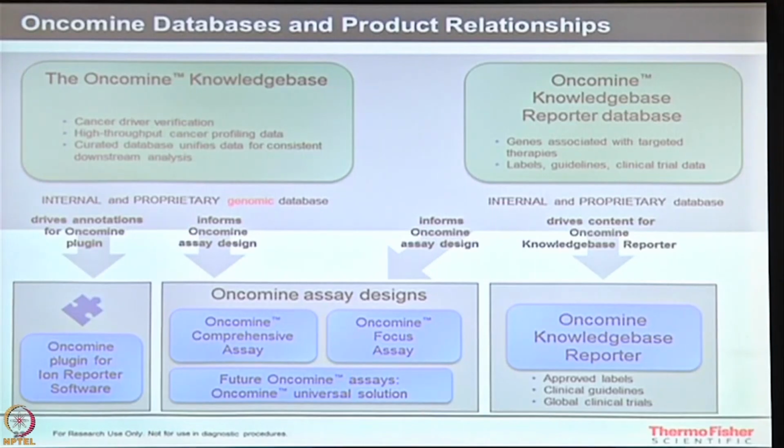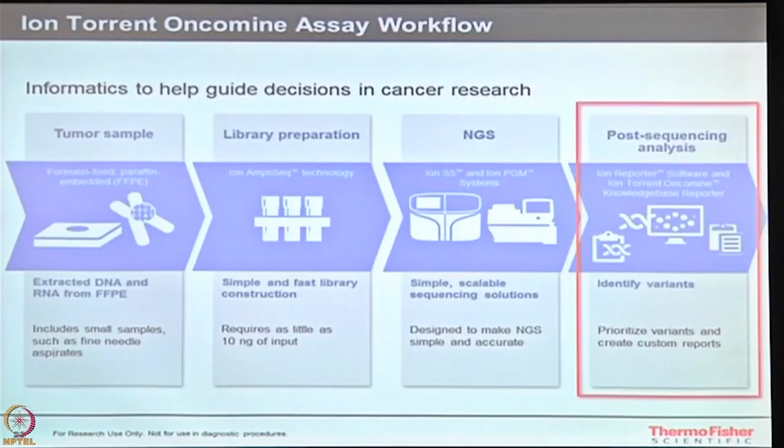You have certain assays available which can be utilized to detect the variants coming into your samples, and the same samples are utilized to denote whether a detected variant has any clinical significance, and with the clinical significance, whether it is correlated to any drugs or not. Okay, so this is something that you have as a summary.